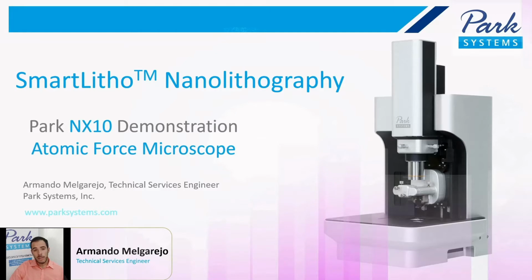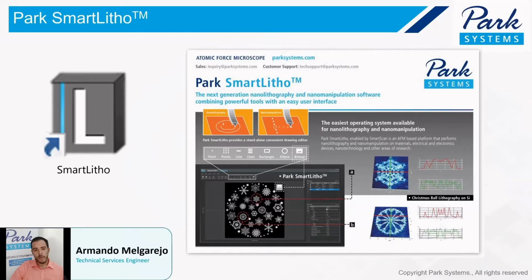Today I'm going to show you a demonstration on a Park NX10, and we will be talking about SmartLitho Nanolithography. For those of you who have never heard the word SmartLitho before, SmartLitho is Park Systems' new nanolithography software, which allows you to do nanolithography and nanomanipulation with just a few clicks.